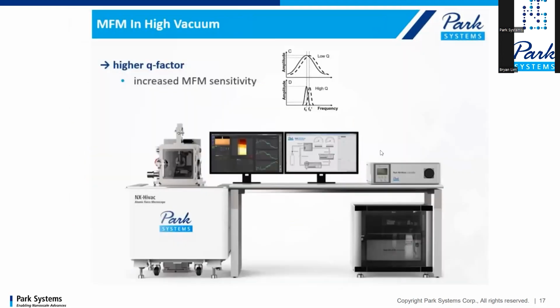Some additional info. If you do MFM in high vacuum, it will also increase the MFM sensitivity by several fold. The reason is that in vacuum, the Q factor of the resonance curve is much higher. When you have a much higher Q, a sharper, more focused peak of the resonance frequency, you get a greatly increased MFM sensitivity.